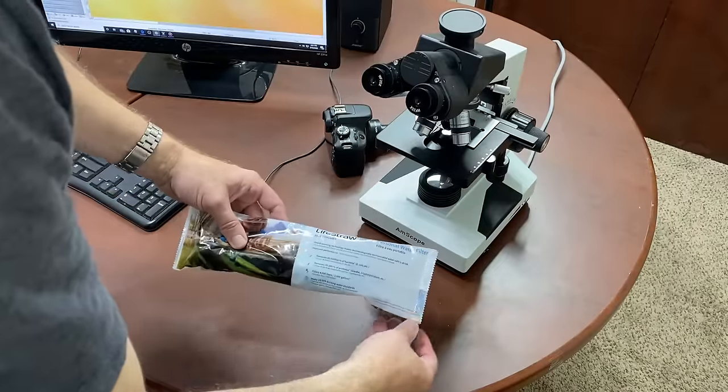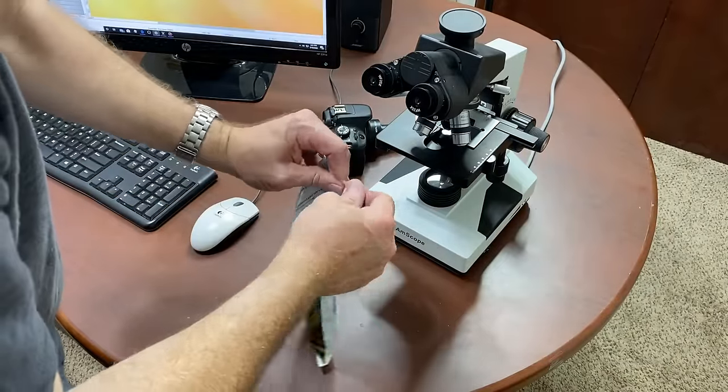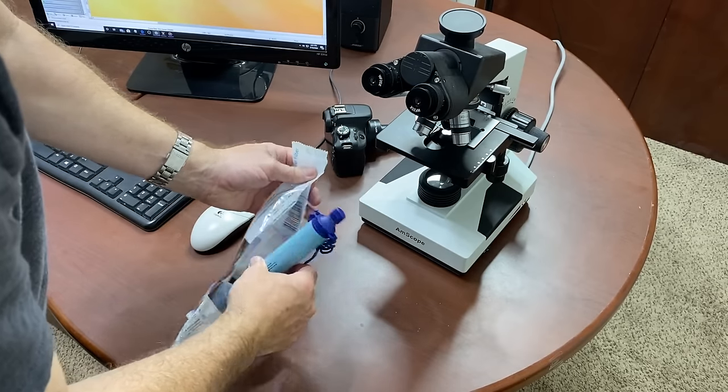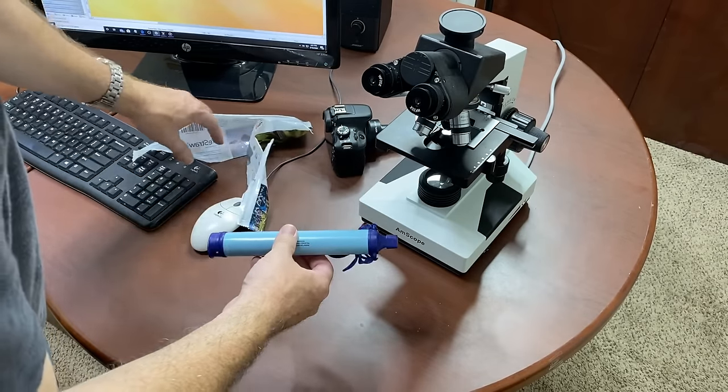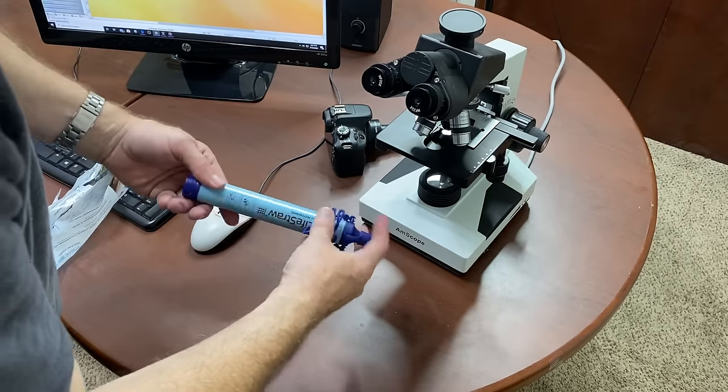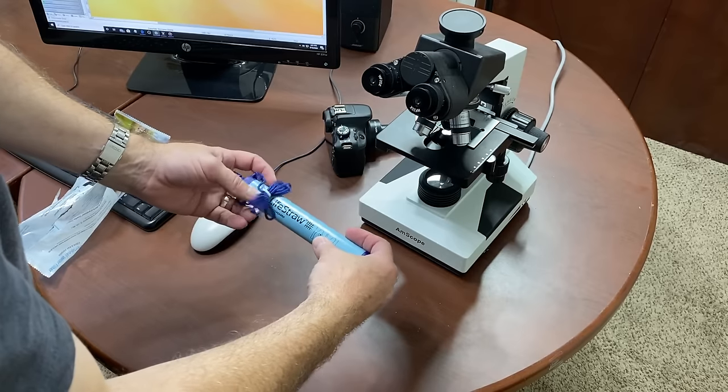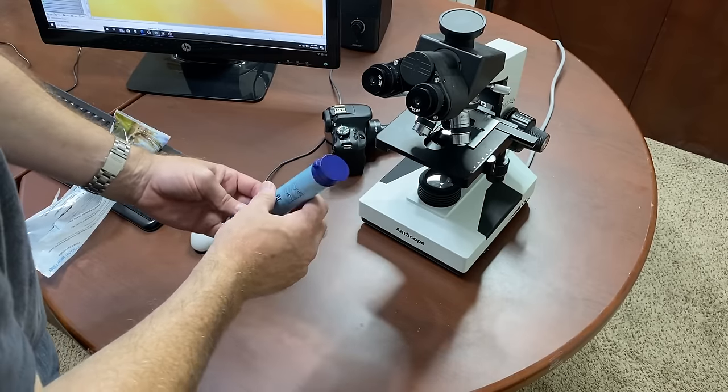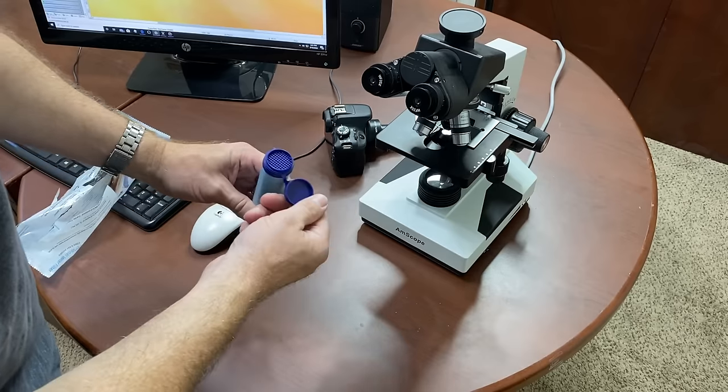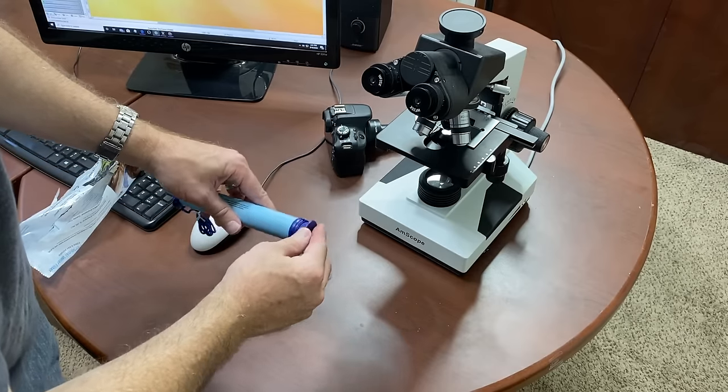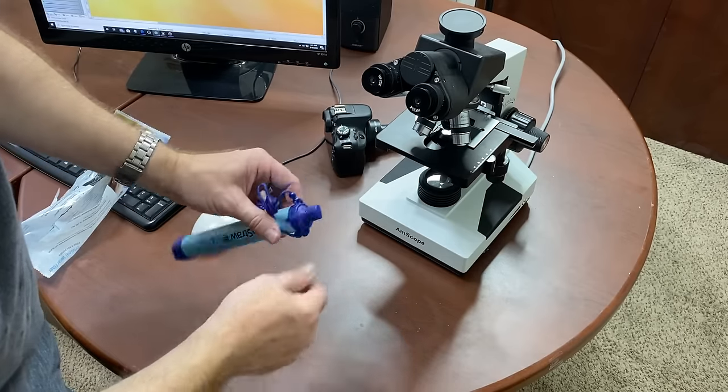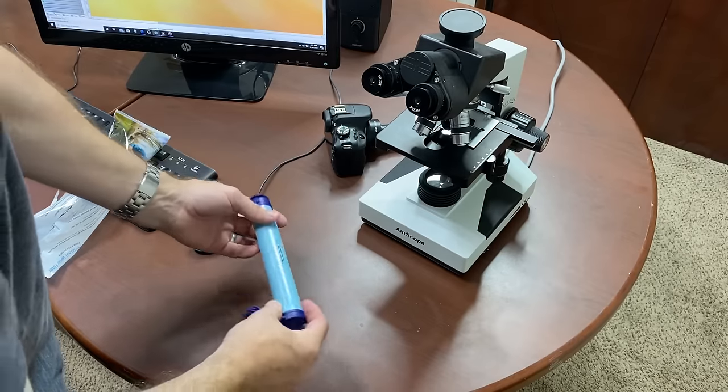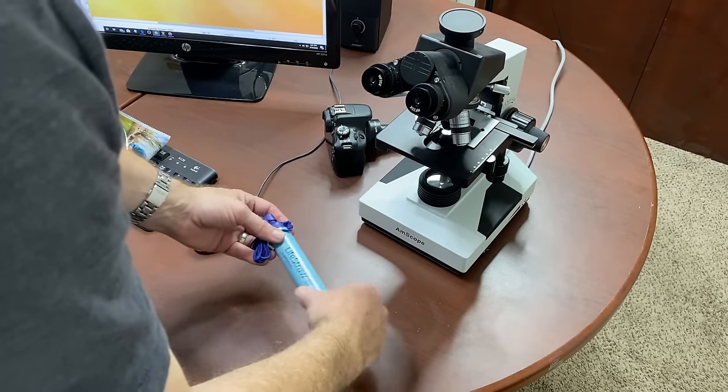I'm going to unpackage the filter here. This is an overview from LifeStraw's website. LifeStraw's membrane microfilters are made of hollow fiber membrane technology, a similar technology used in kidney dialysis. These membranes are made of small straws that contain microscopic pores of 0.2 microns in diameter. Dirty water enters one side of the straws and clean water passes through the pores while bacteria, parasites, microplastics, dirt, and other forms of turbidity are blocked and unable to pass through because they're too large.